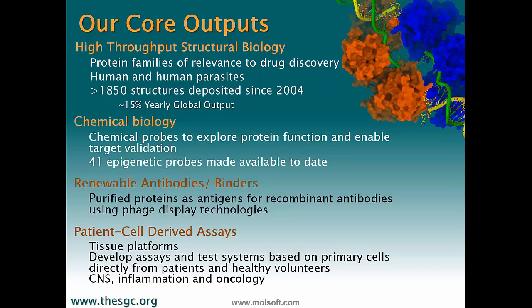And more recently we've been starting to use our chemical probes and our antibodies in the context of patient cell-derived assays with bespoke tissue platforms in particular areas such as oncology and inflammation. So this is quite a broad range of things that we do.